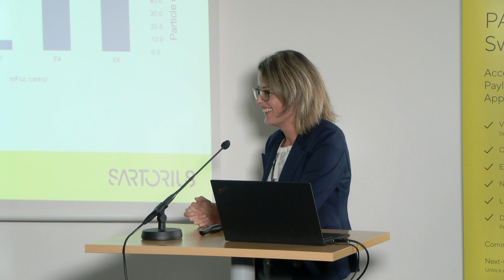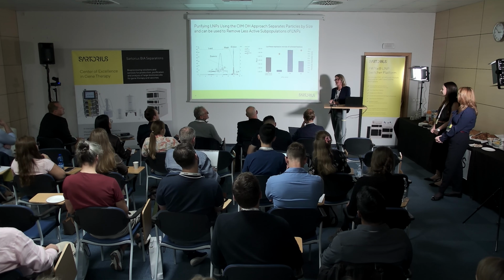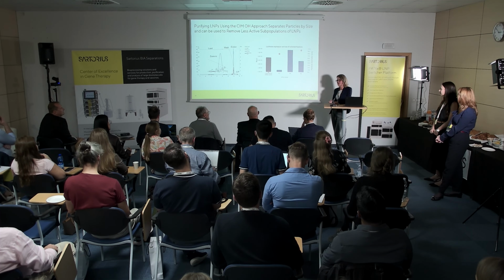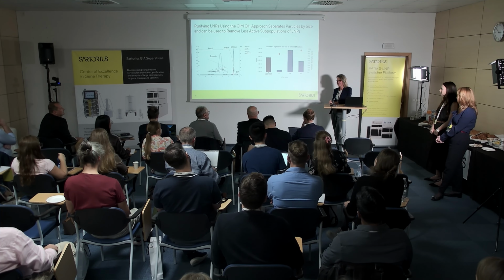Right. Maybe a quick one. I can send you samples. So the upscaling: you go from some micrograms to, what was it, 150 grams? How far did you verify that? We verified that on the 10 milliliter scale, so 40 liters is yet to be verified. It was verified with other particles, so we are confident it will work also for the LNPs. Okay, thank you.